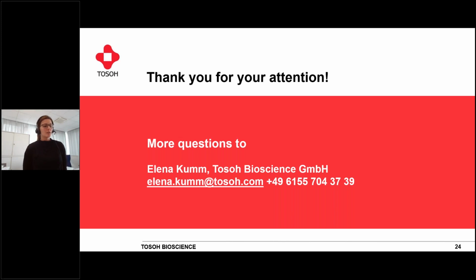You just have to take care that you adjust your buffers, so you need to use volatile salts, for example ammonium acetate or ammonium bicarbonate. Citrate might not be suitable for every molecule you're looking for. Of course, you can go for desalting steps in between, but then you don't have inline chromatography and MS measurement.